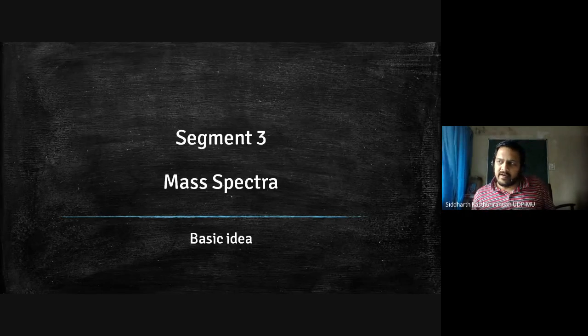The result which you are expecting is that there is a particular electron density distribution, which basically the electron wave function squared will give you, and with that density distribution, when it interacts with the magnetic field, it causes a certain amount of shielding.